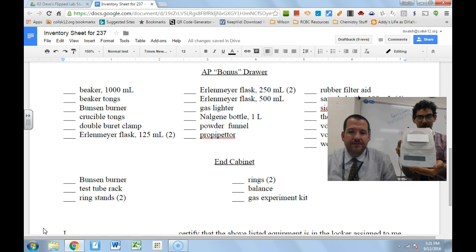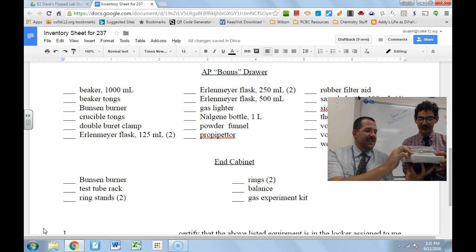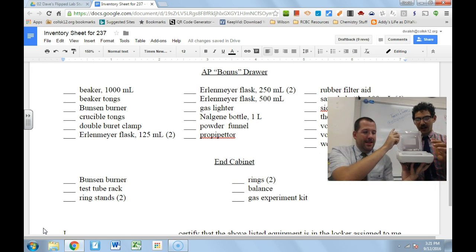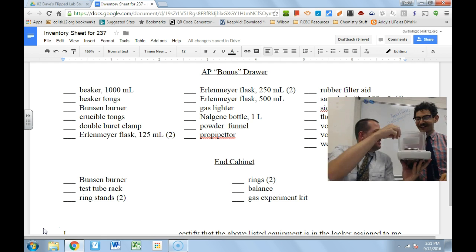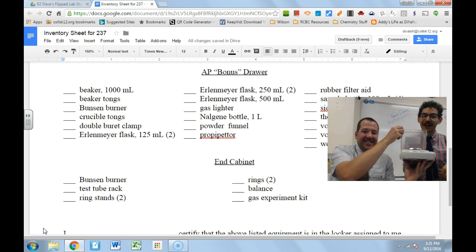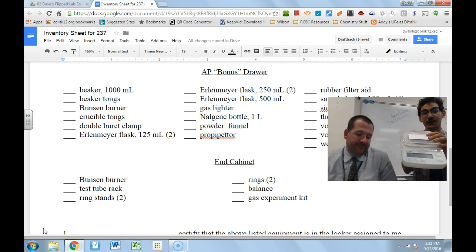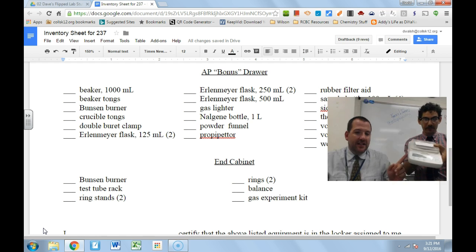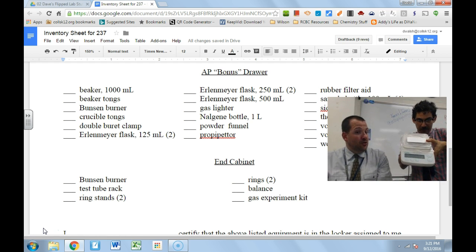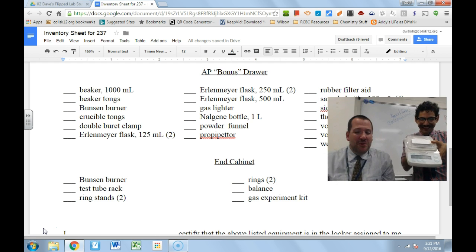Last, we're going to talk about our digital balance. We can put our samples on top to weigh them — I'd have to remove the plastic cover, but the circular pan where you load your supplies can come flying out if it's at the wrong angle. On the front you'll notice a digital readout that will tell you the exact amount of substance you've added. The balance will likely be kept out on top of the table rather than in the end cabinet.